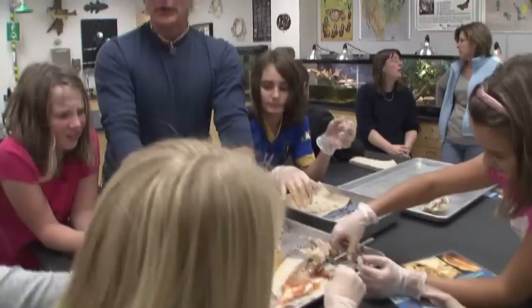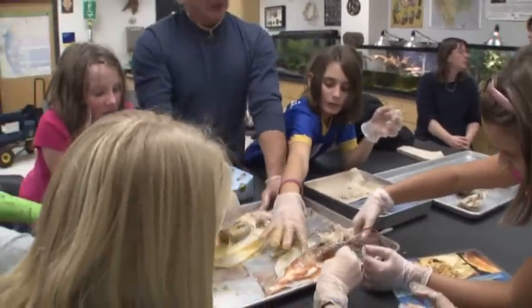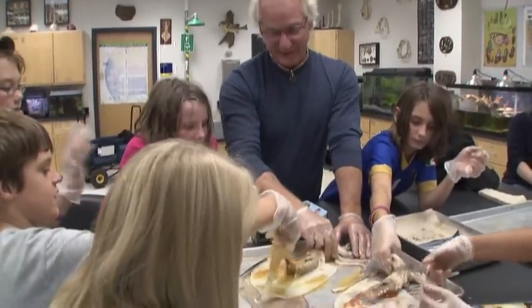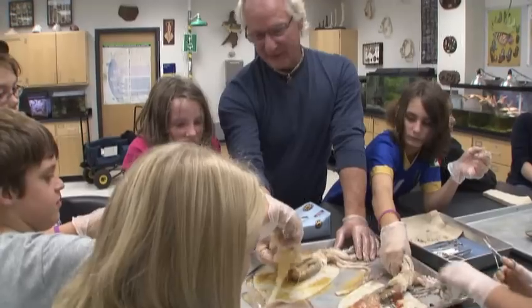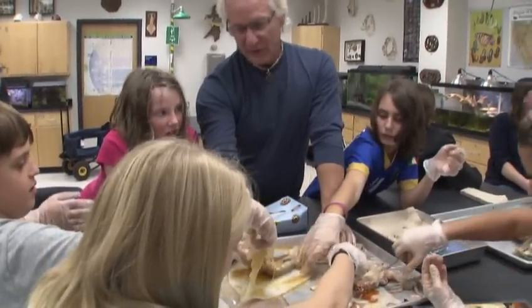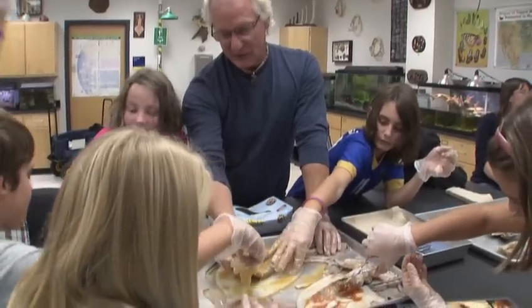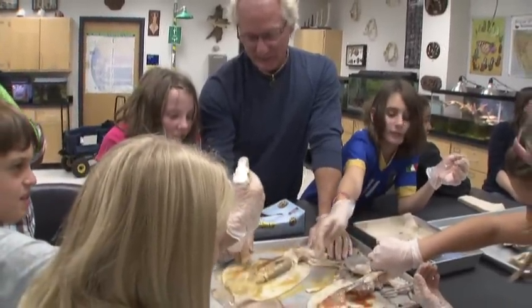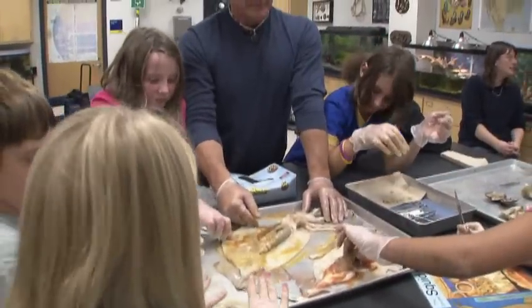Anyway, this is a pretty highly modified animal, isn't it? When you think that the clam over here is a filter feeder, and this thing, this is all eggs. Well, there's oviducts in here, and the cecum is back in here. You cut that out. Isn't that cool?